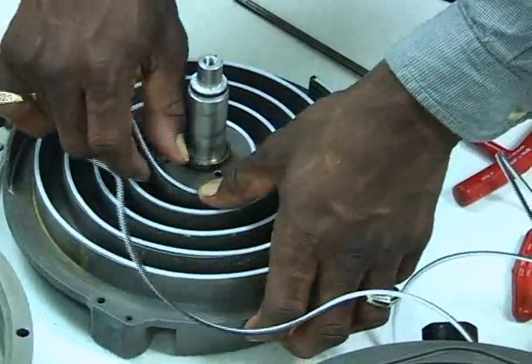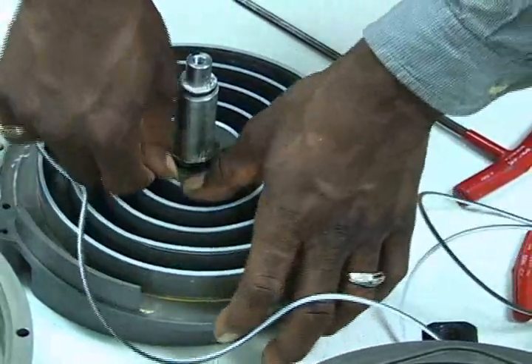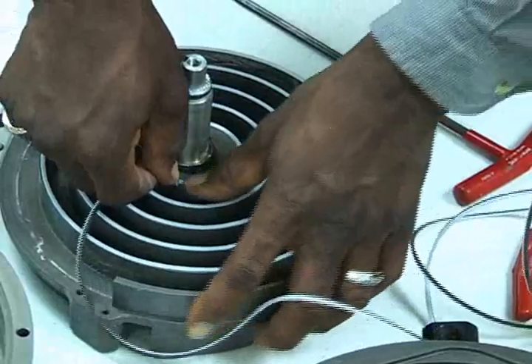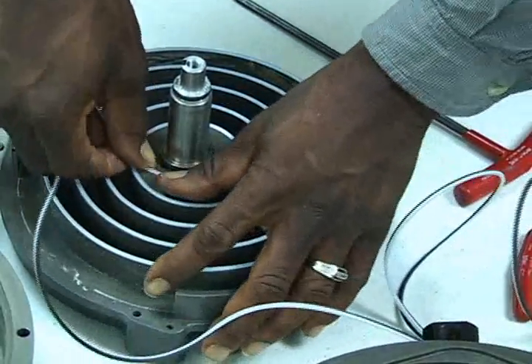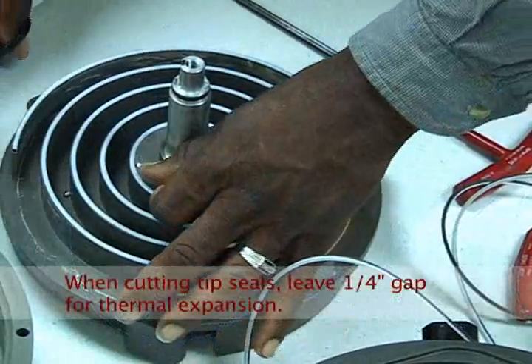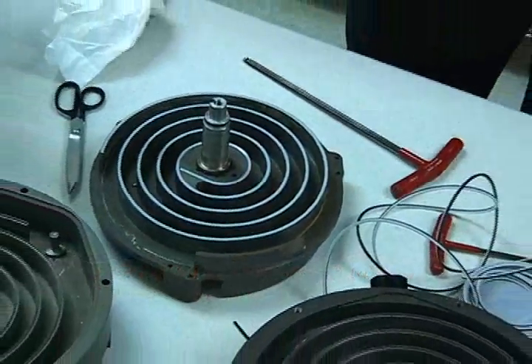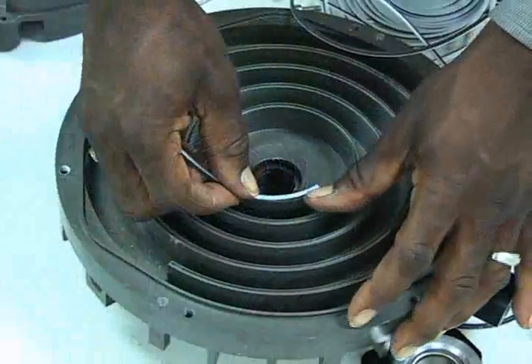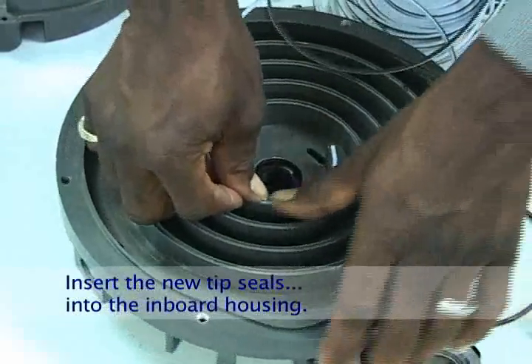The tip seal should stay in place. When you get to the end of the groove, cut the tip seal, leaving a quarter inch gap for thermal expansion. Follow the same procedure to install the tip seal in the inboard housing.